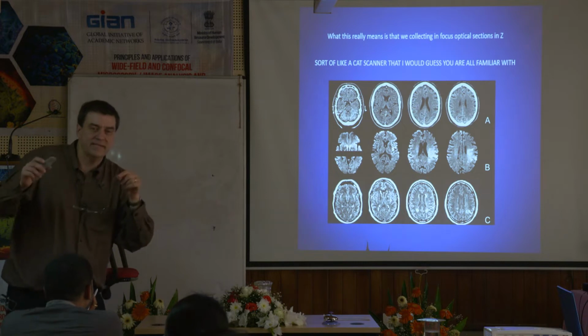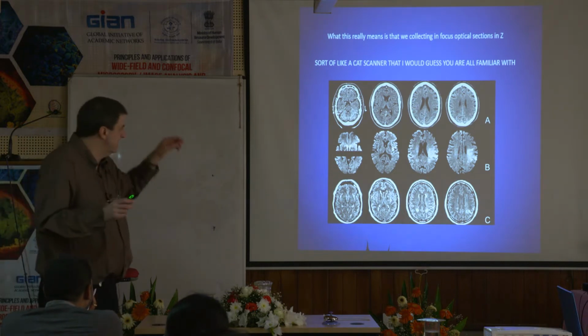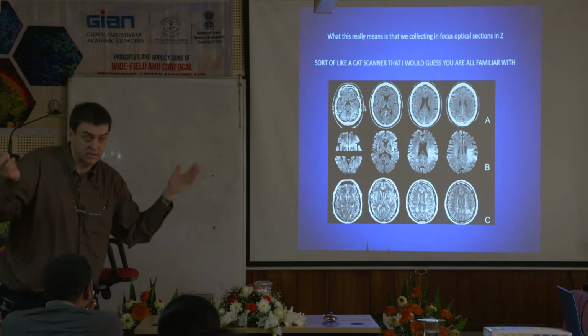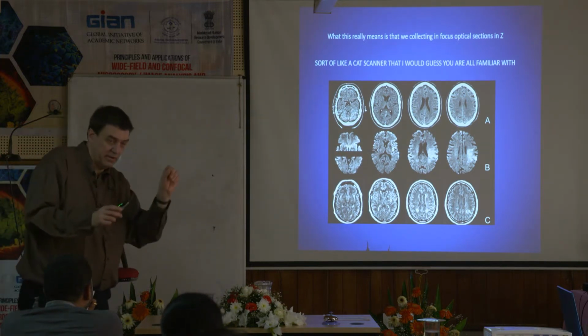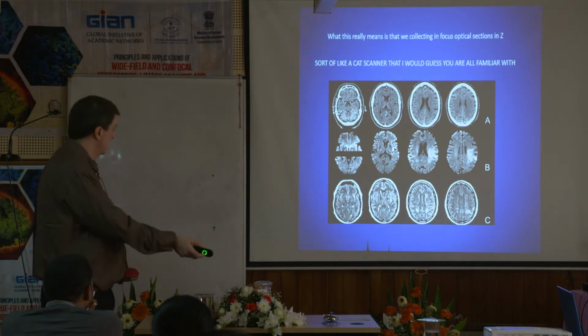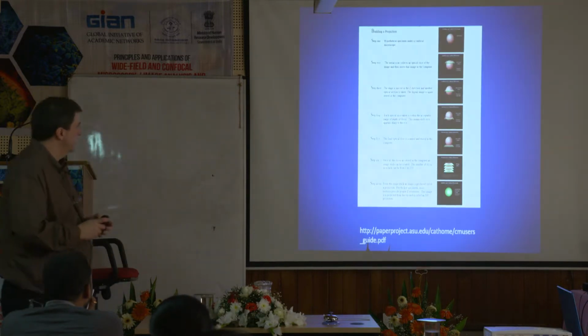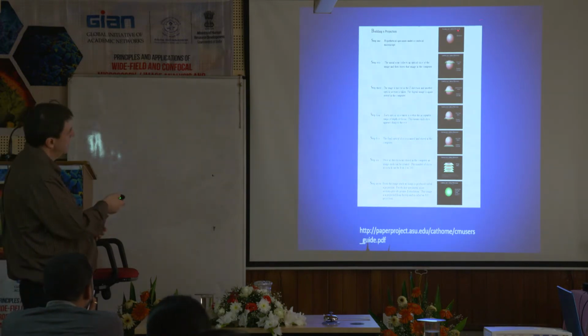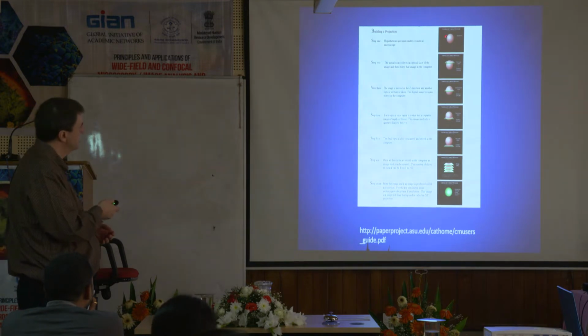Okay, same idea here, except instead of using X-rays, we are using optics. We are using a microscope to do this, obviously on a much smaller level than a brain. So if we take a look at this here, we have our piece of tissue represented by a ball, more or less, a sphere in three dimensions. So we have it on the confocal microscope.